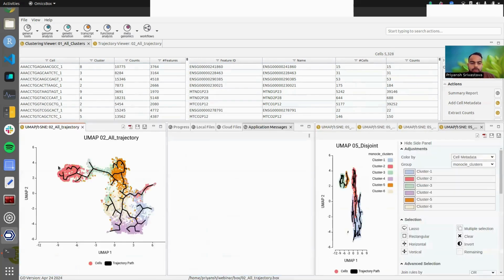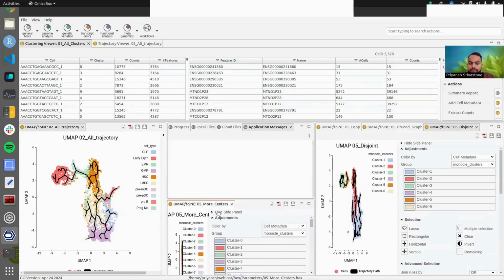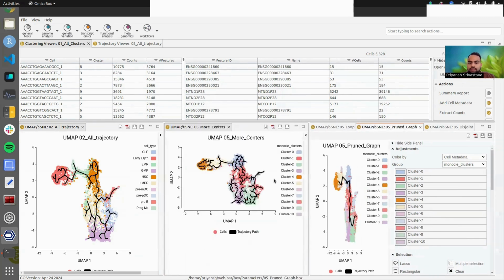Okay, so that's one, and that's two. Okay, let's first see these.